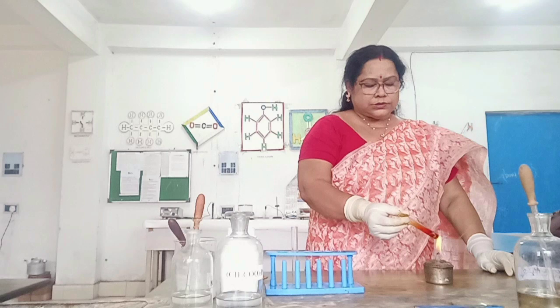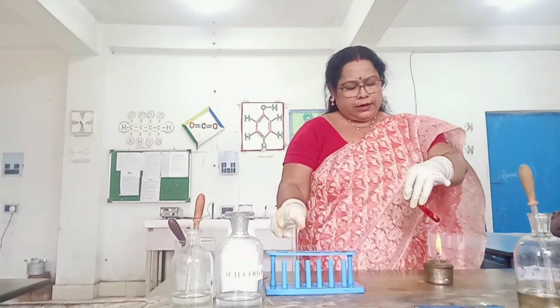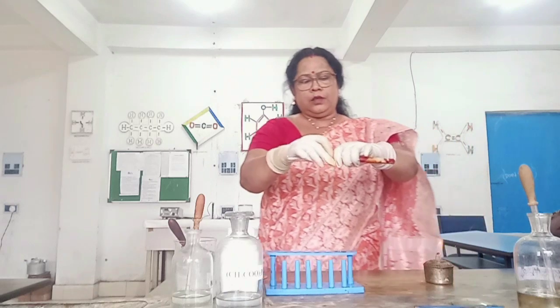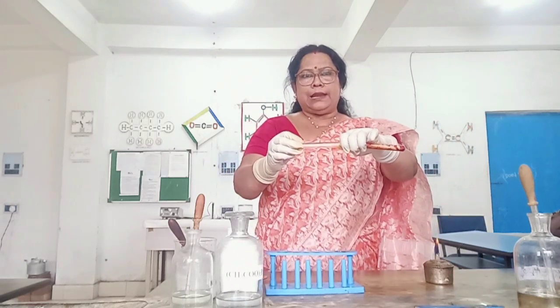Chloride reacts with potassium dichromate and concentrated H₂SO₄ to produce red vapors of chromyl chloride. Cover the test tube with an empty test tube to collect the red vapors.